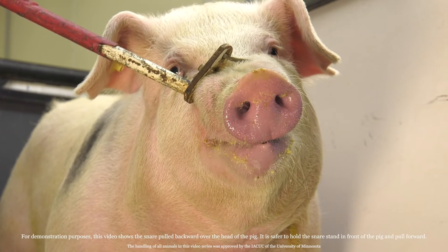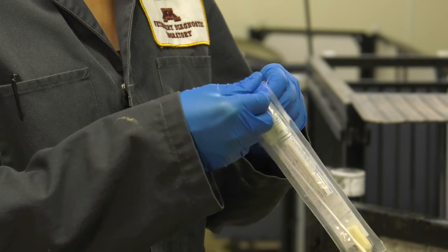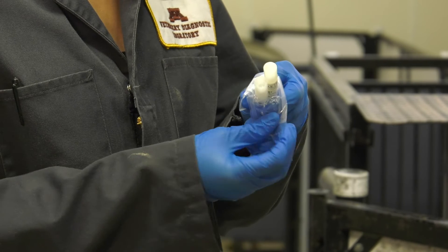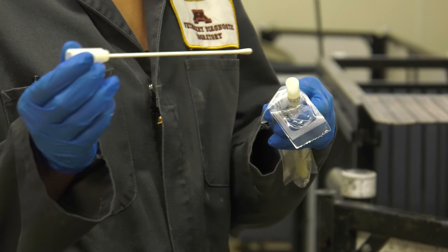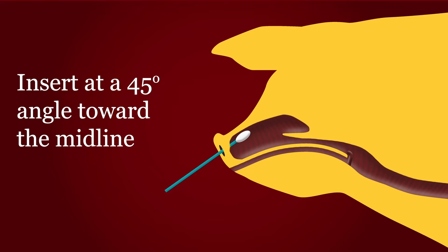Restrain the pig using a snare. Keeping the animal steady will ensure the safety of everyone involved. Remove the swab from its packaging. There are several different types of swabs, but rayon like the one we're using today is ideal and cotton should not be used. While the pig is still, insert the swab into the nostril at a 45 degree angle toward the midline, approximately two to three inches or five to ten centimeters deep.